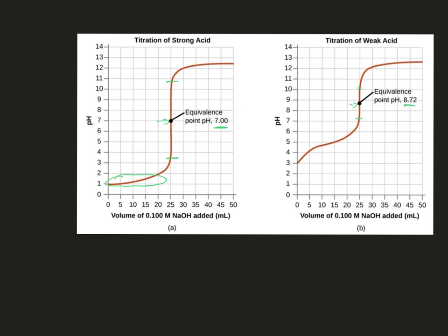You can see that initial part of the curve here. This is where the buffer system is being created. And here in this section is the buffering region.